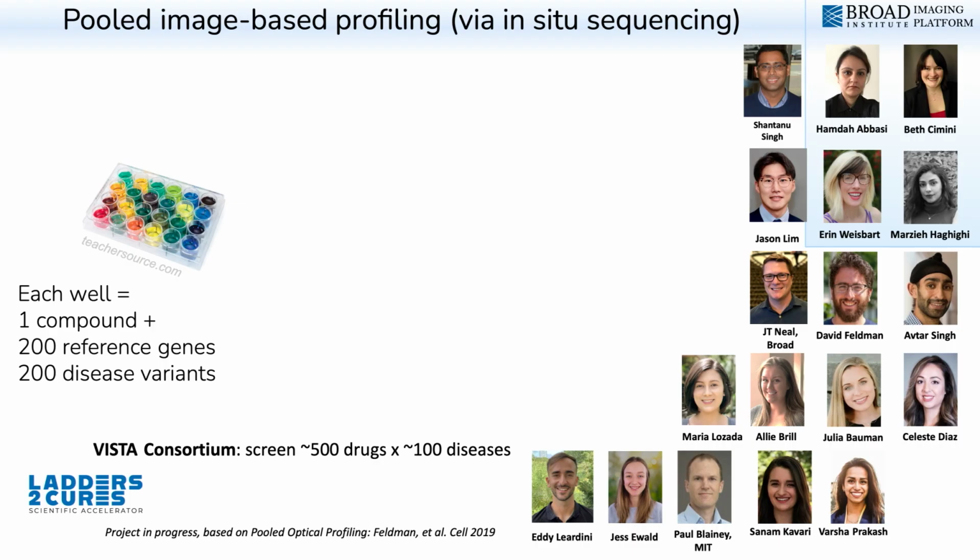And then you go and pour a different chemical. You can go and buy it from CVS or whatever, right? So basically, you just look for some drugs that are already approved, and pour them into each of these wells, and then you look to see whether the drug is able to revert the phenotype of any of the disease-associated alleles, like the Noonan syndrome-associated allele, back to looking like a healthy state. And that's it. You can do this large experiment in a single large well. So now, of course, how do you go and figure out which cell got which perturbation?